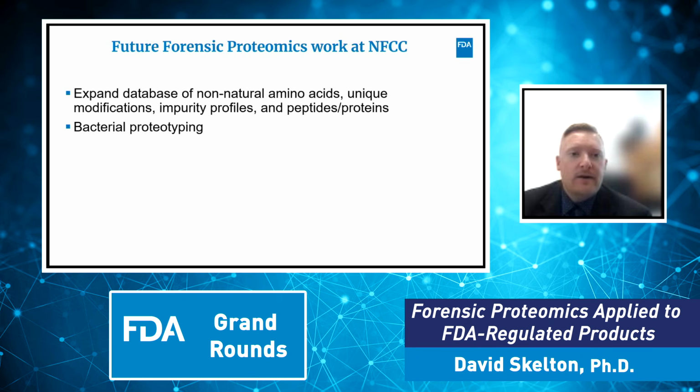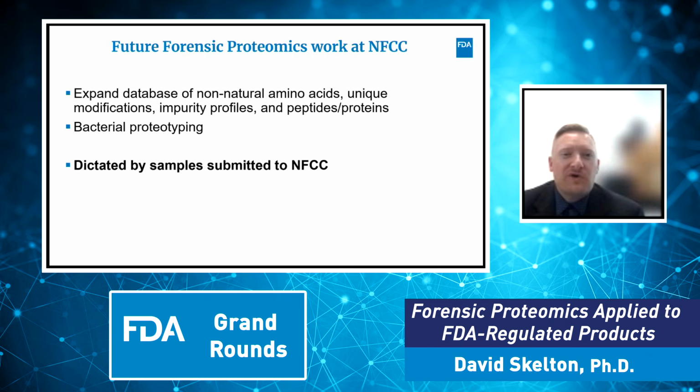Recently, we've been working on bacterial proteotyping, which is utilizing LC-MS to rapidly identify and characterize bacteria in samples. However, what we are working on is really dictated by the samples that we get in. So I will say this is currently some of the work that we are doing, but if next week we get in a bunch of monoclonal antibodies, then we pivot and now we're doing monoclonal antibody method development. So what we are doing here at the NFCC is dictated by the samples that we get in and what is needed from us.